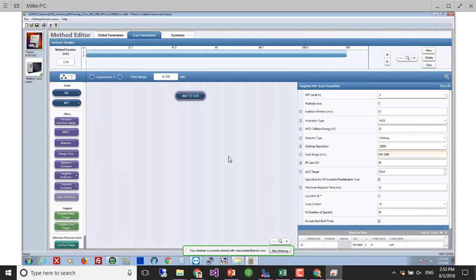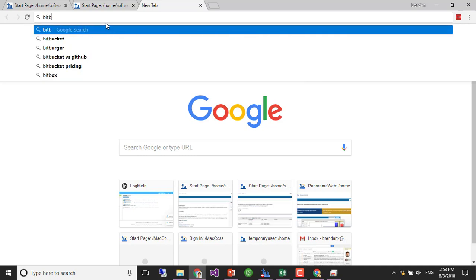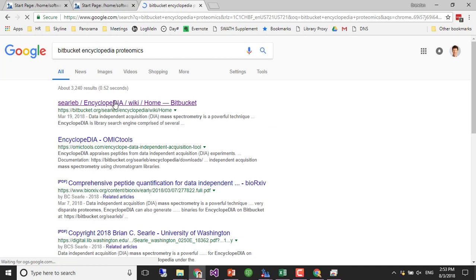Okay, so those are some basic settings, but what I want to show you here is one of the slides from the last session.